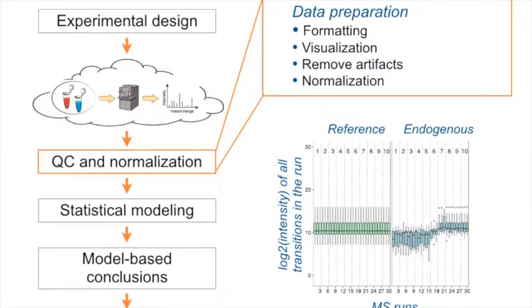So when you mean standards, do you mean internal standards, like some proteins that you choose? That's exactly the discussion we just had. So it can be essentially any protein which you know does not change biologically. And it can be because you spiked an analyte in a constant concentration, or because it can be a protein which is regulated so tightly that it would not shift.